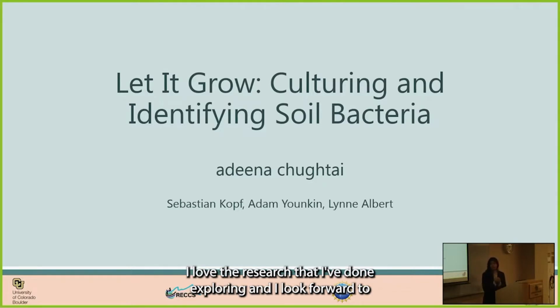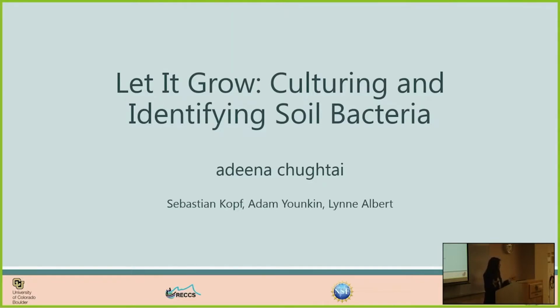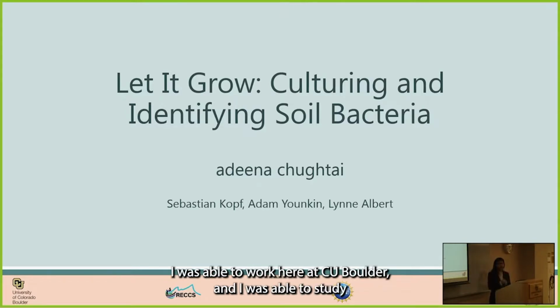I've loved the research that I've done this summer and I've been looking forward to sharing this information with you all. So this summer I was able to work with a lab here at CU Boulder, and I was able to study or research basically how to culture and identify soil bacteria.